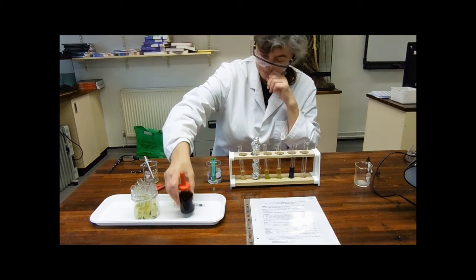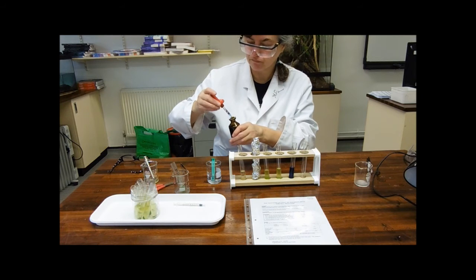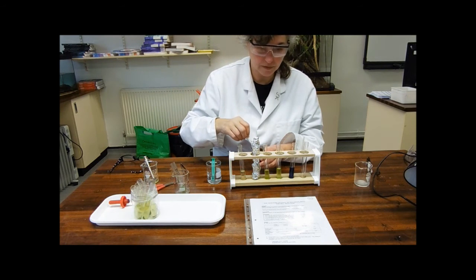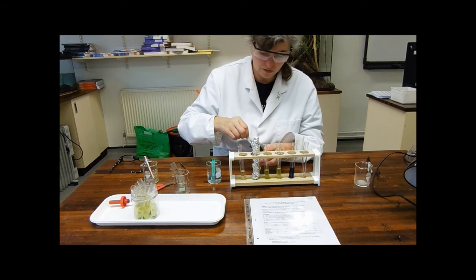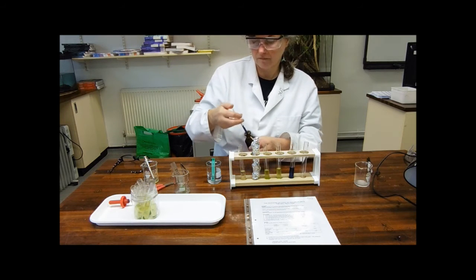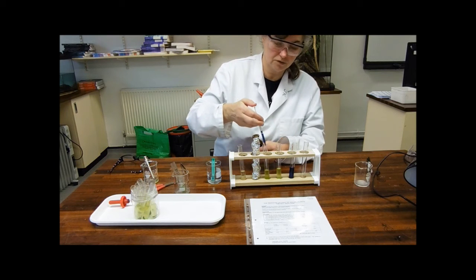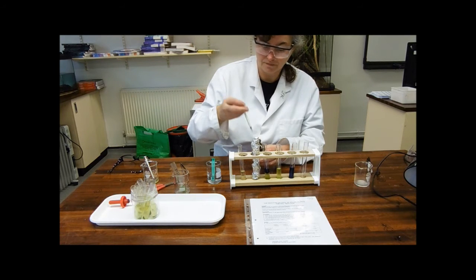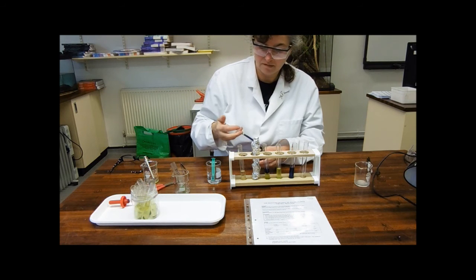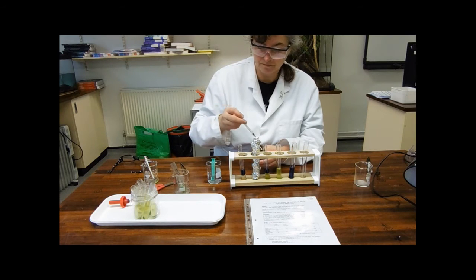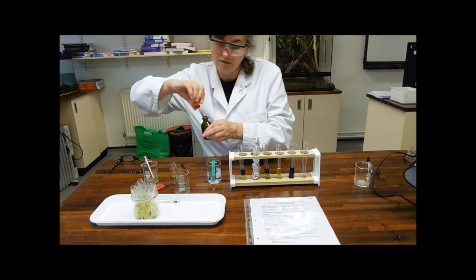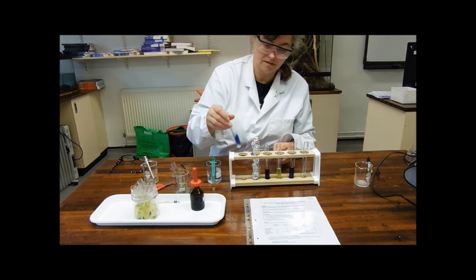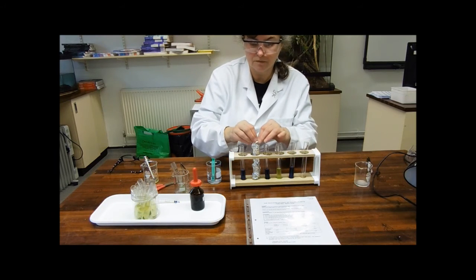And I now need to put my DC-PIP in. So I'm going to put in half a milliliter of DC-PIP into tubes three, four and five. And I'm going to give them a bit of a mix. And then I'm going to have to be really quite quick with what we're doing now.